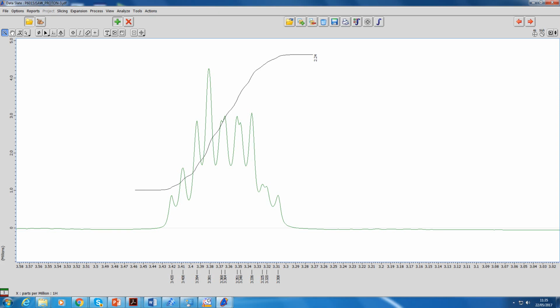Of course, you can do everything we've said about labeling peaks and doing integrations, etc., on this lower peak, which is the DPG spectrum. So MPG and DPG. Yeah, if you want to remove that and go back to where we were, then we can. How do we do that?